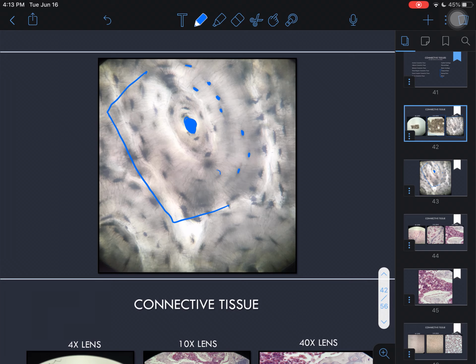And then we have these little stringy guys that look like they're all coming down to connect to that central canal, right? And those are called canaliculi. They come usually from these cells right here, the osteocytes and lacunae, right? And they reach forward and back, and those canaliculi are how they get nutrients from the center of the bone, give back their waste, and it's how they communicate with the other cells.